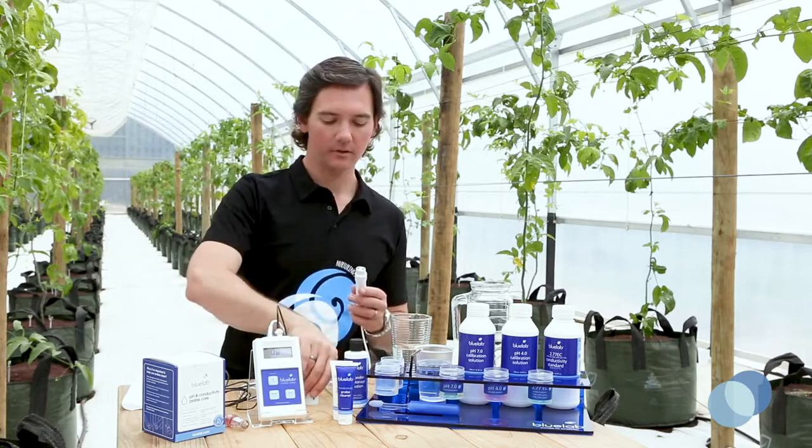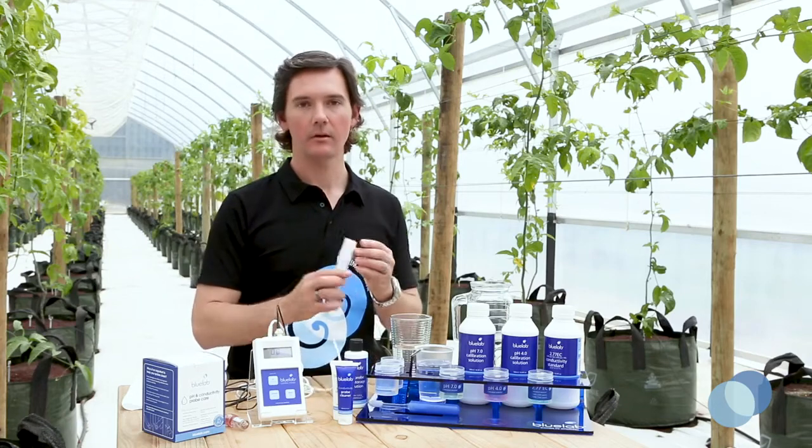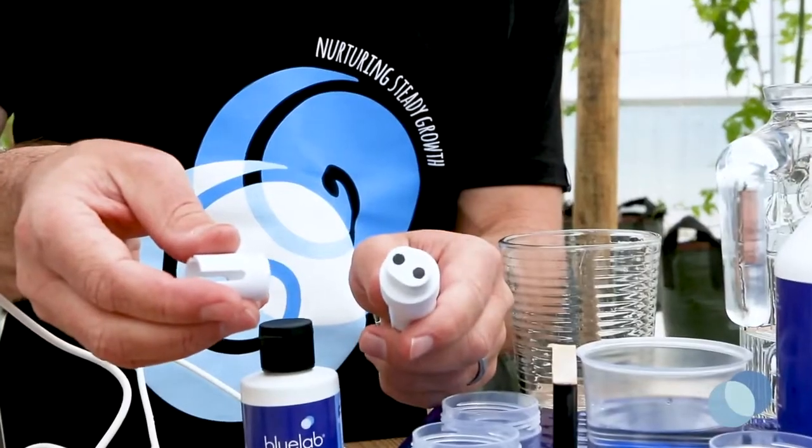Shake off the excess water and put the shroud back on. Be sure not to touch the face of the probe with your fingers as you could contaminate the probe and cause improper readings.